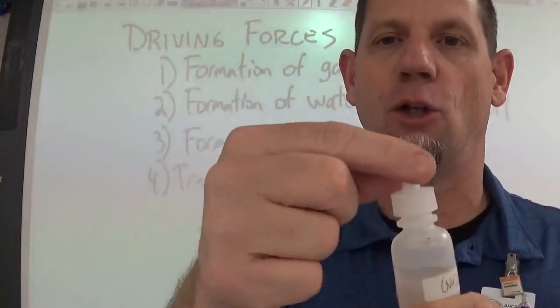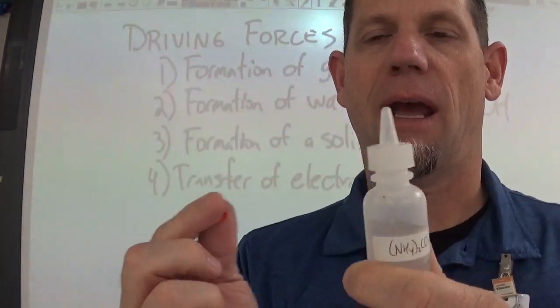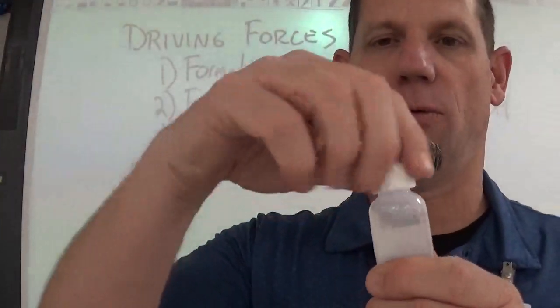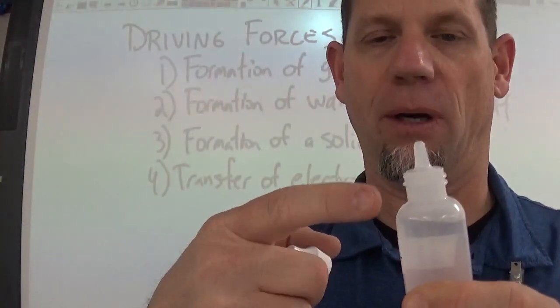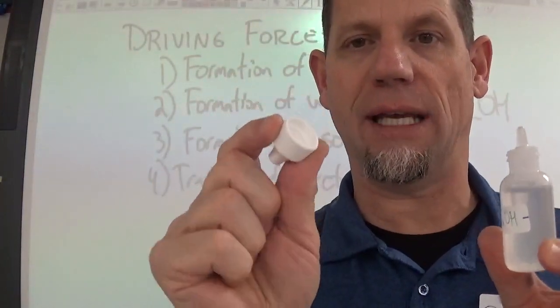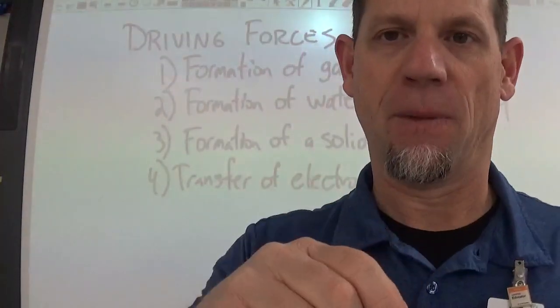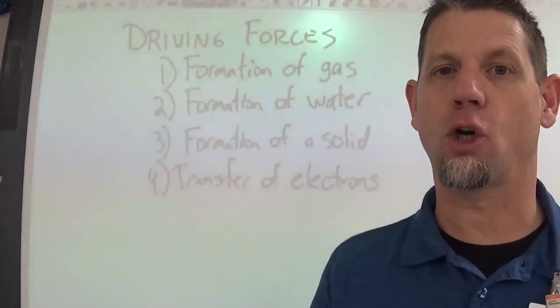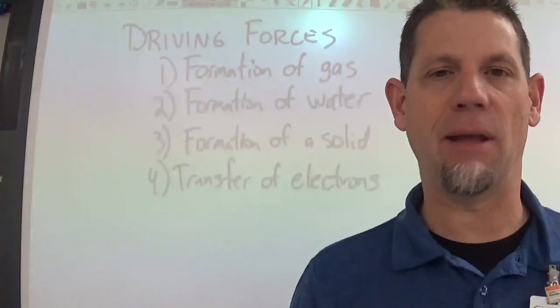For the red lid, you pull the little red lid off and then you put the little red lid back on. The same thing is true with these that have the unscrew tops that reveal the dropper. Every time you use this, you need to hold on to the lid and replace it immediately. If you were to use this lid on one of the other substances, you could cross-contaminate our substances and they won't work right anymore.